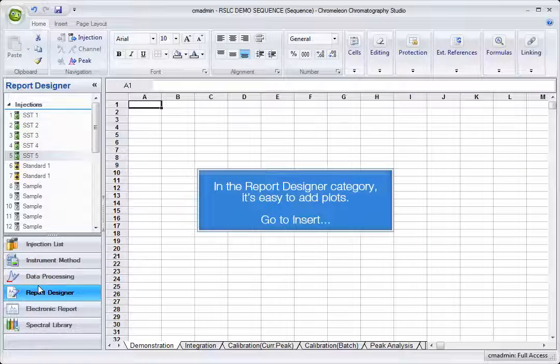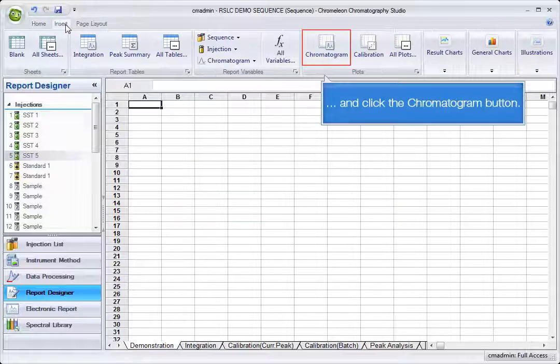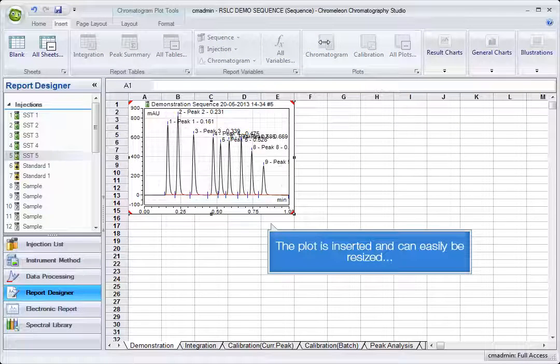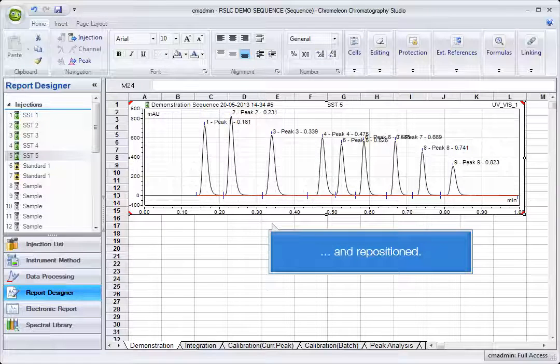In the report designer category, it's easy to add plots. Go to Insert and click the Chromatogram button. The plot is inserted and can easily be resized and repositioned.